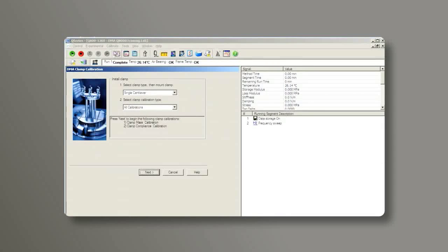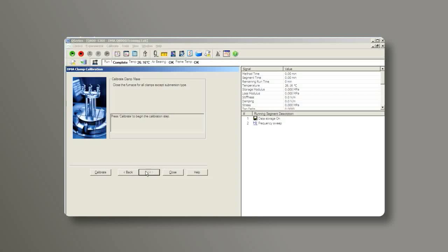From the control software, go to calibrate, clamp, choose single cantilever, all calibrations, next. Close the furnace from the instrument touch screen, then click on calibrate.